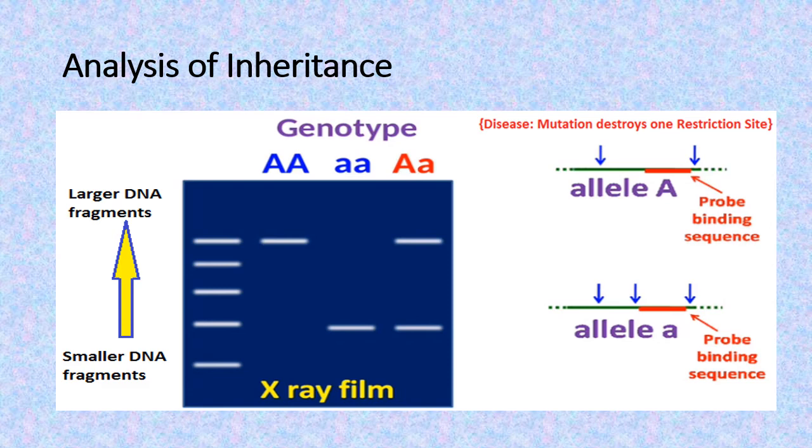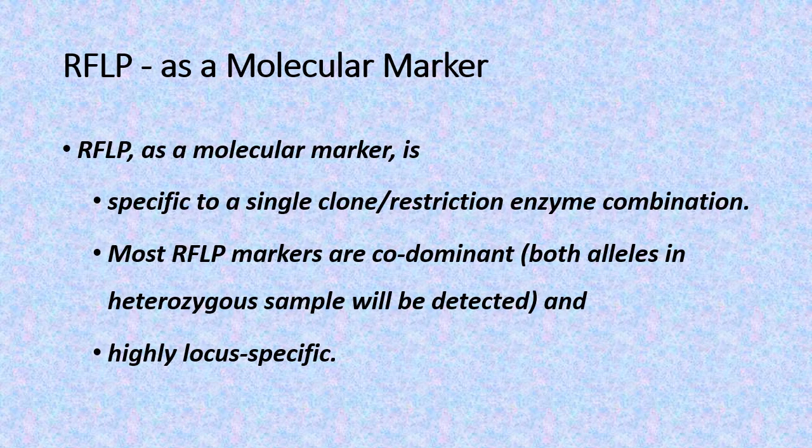So in this manner, we can analyze not only the inheritance pattern, but also the mutations which destroy one of the restriction sites by using this method.